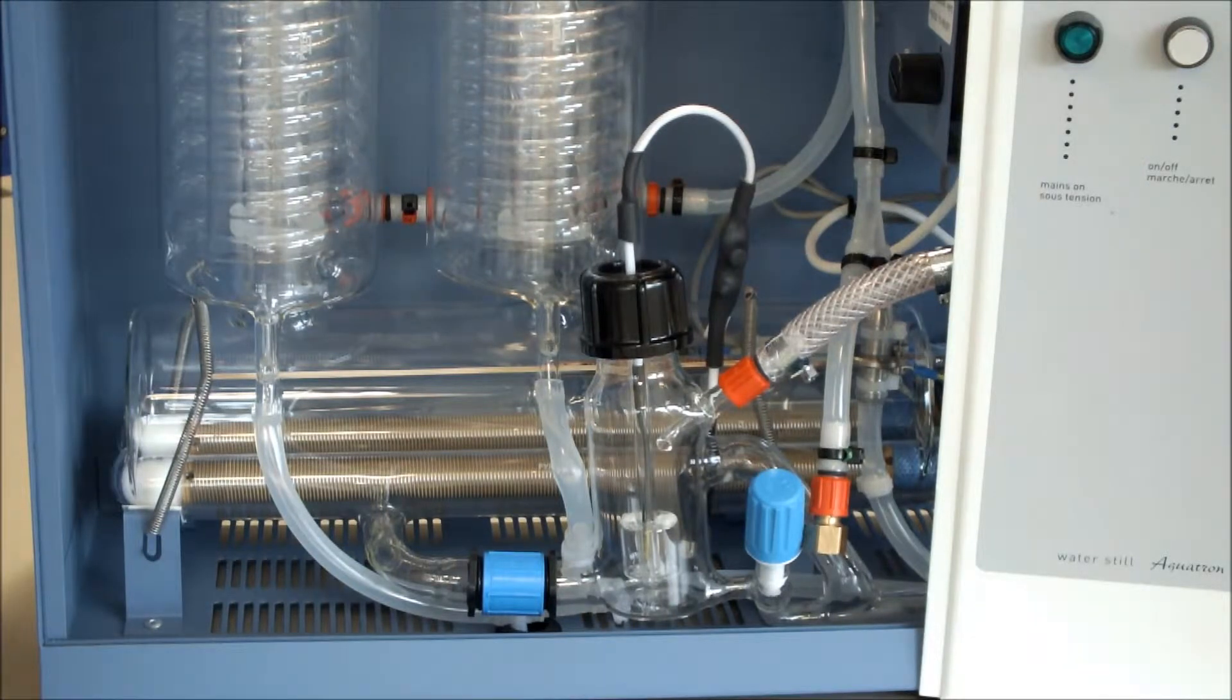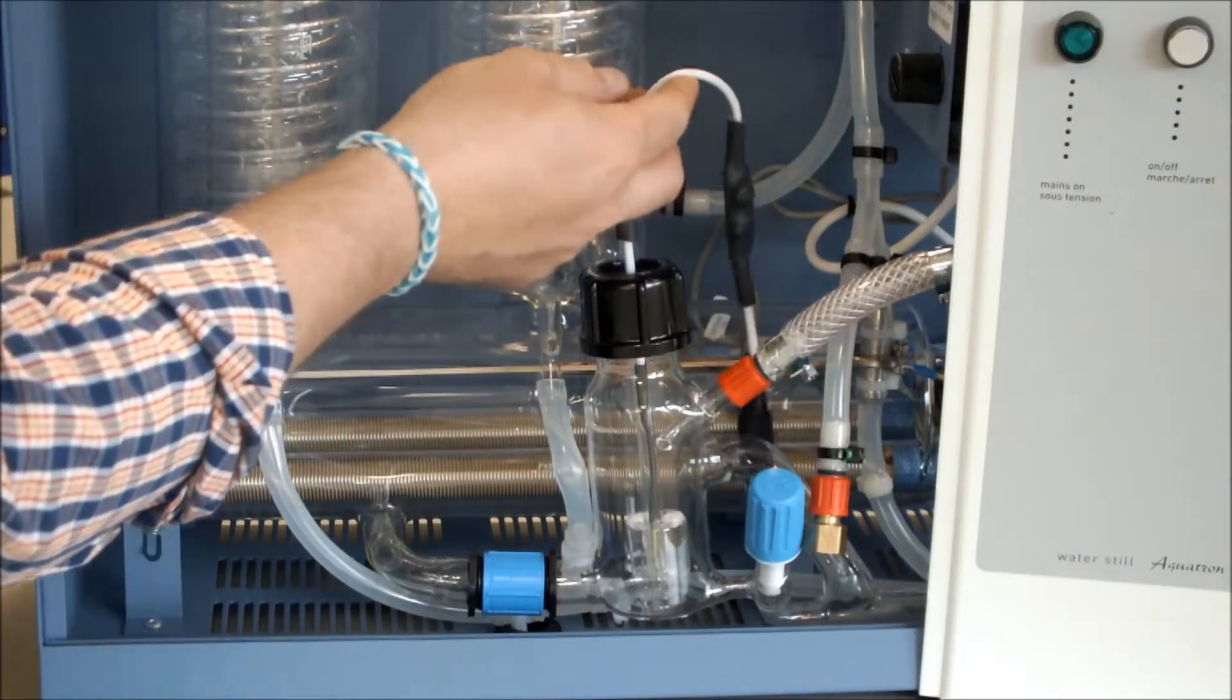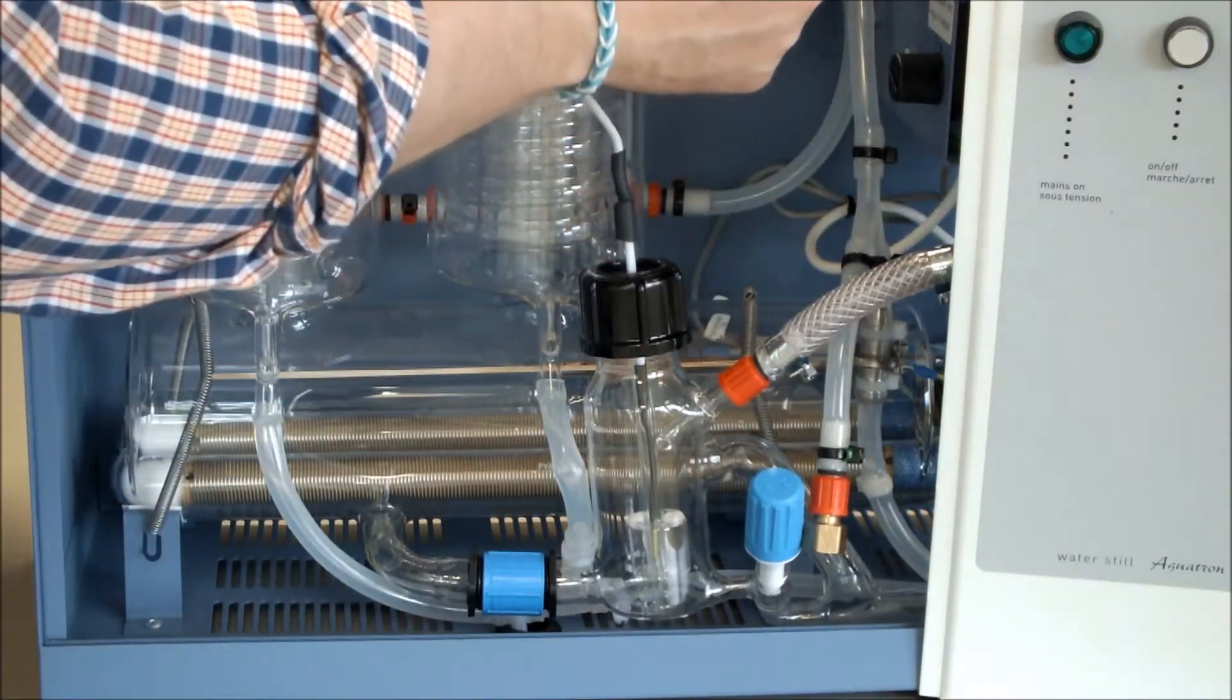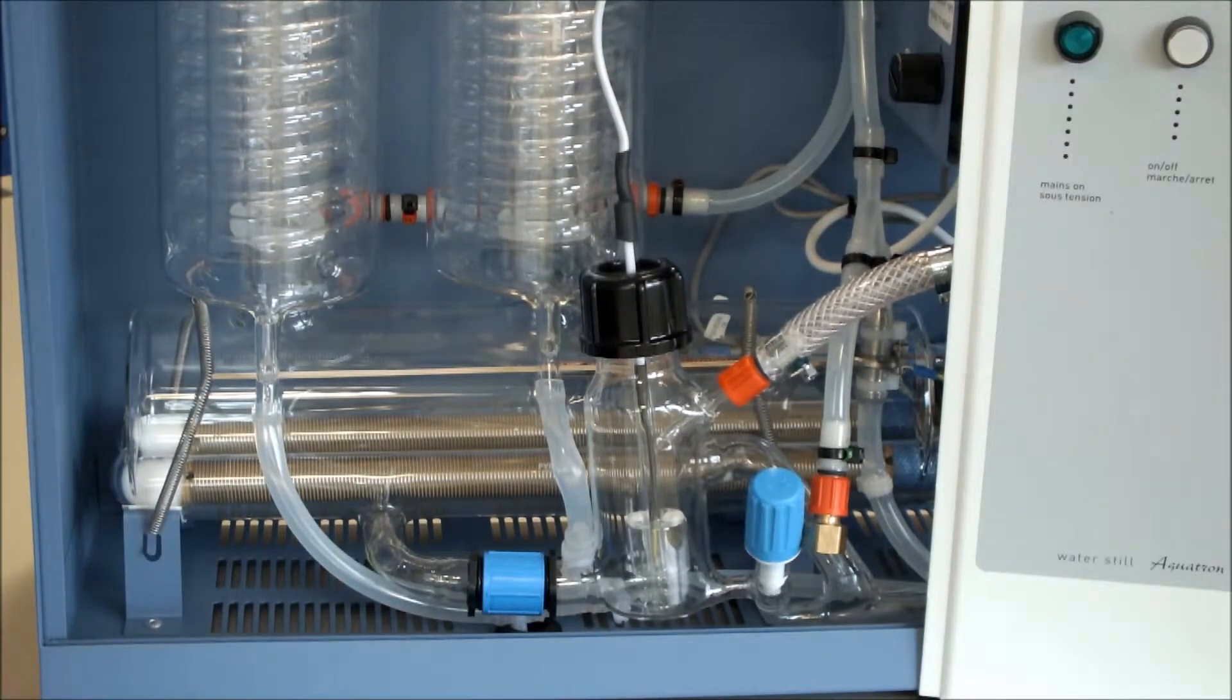We then remove the black cap from our plug, and we connect the plug from our float switch assembly into our socket, like so.